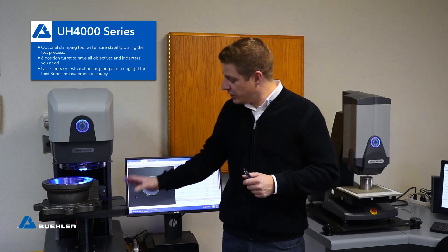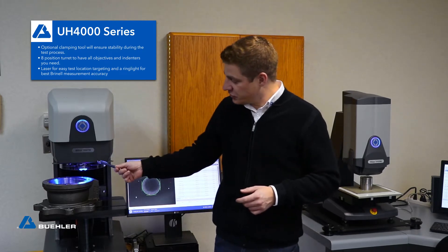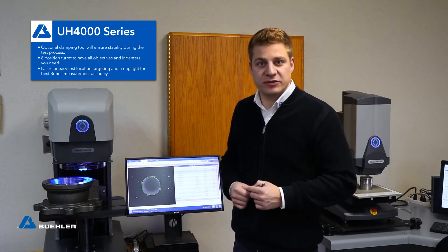Here we showcase our latest and greatest universal hardness testing line, the UH-4000 series. It comes with an 8-position turret, a darkfield illumination, as well as a target laser.